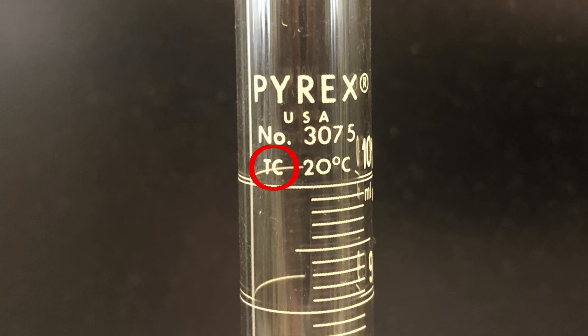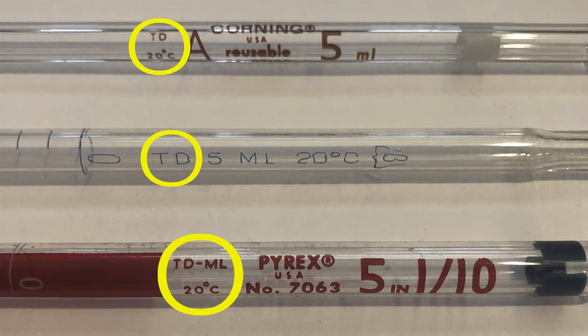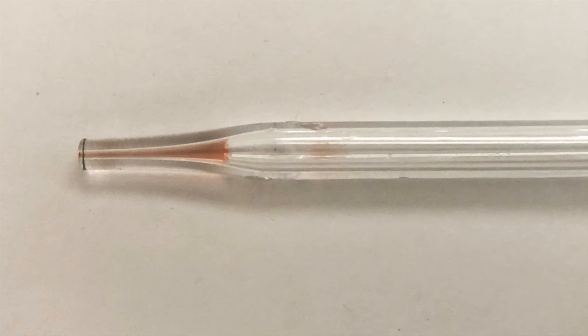Your device may be marked TC for to contain or TD for to deliver. To deliver means that last drop of liquid is supposed to remain. You don't have to worry about it.